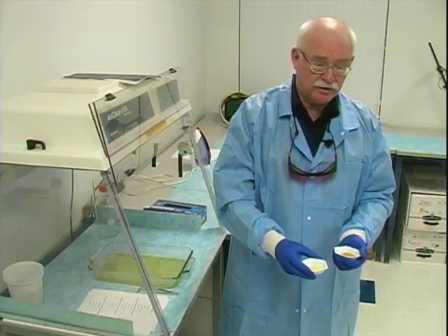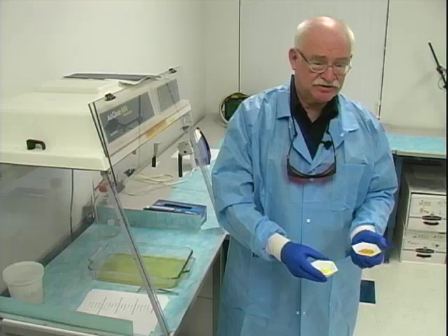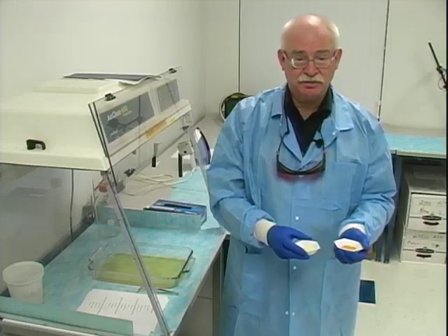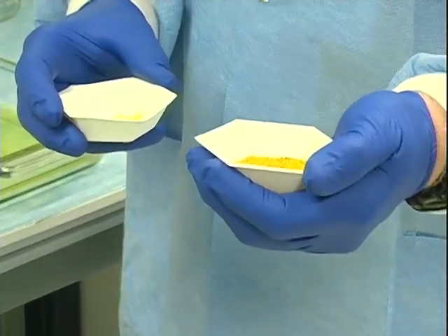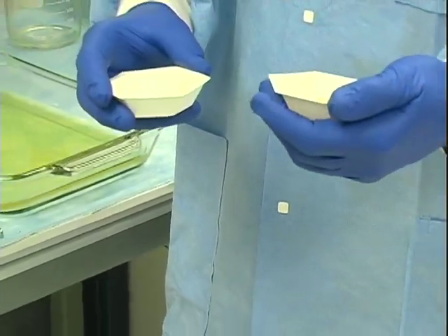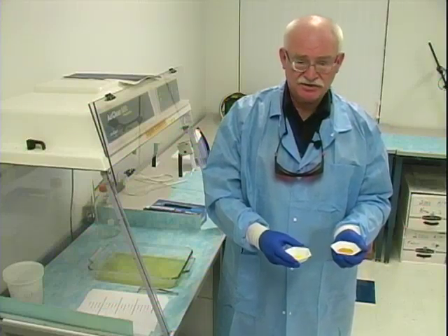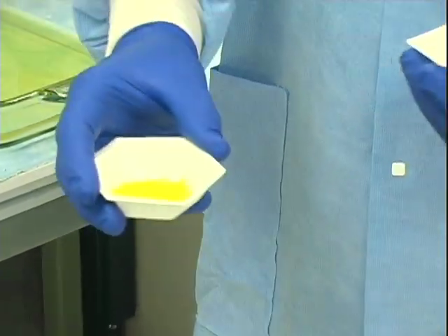I am familiar with the one on the right — the yellow powder — and the results that it gives. I can't eliminate the possibility that the darker one would work, but I'm not sure of it. Therefore, I'm going to be very careful about the supply source. Be very careful about your supply source and govern yourself accordingly when purchasing.